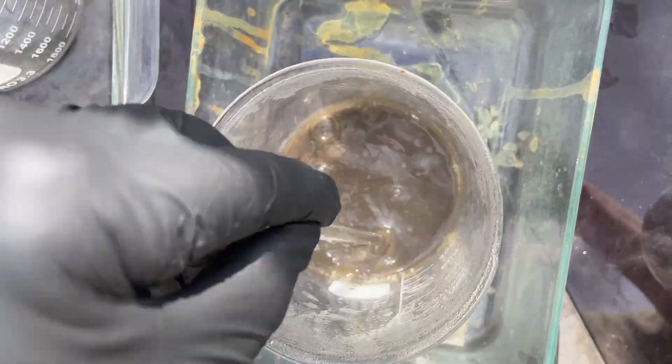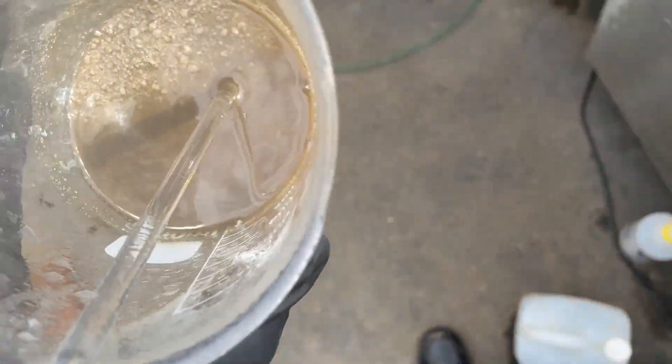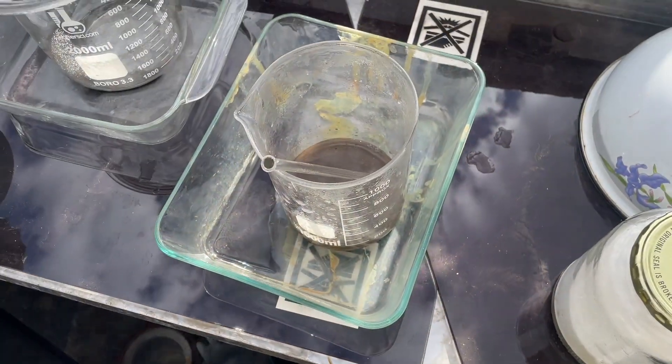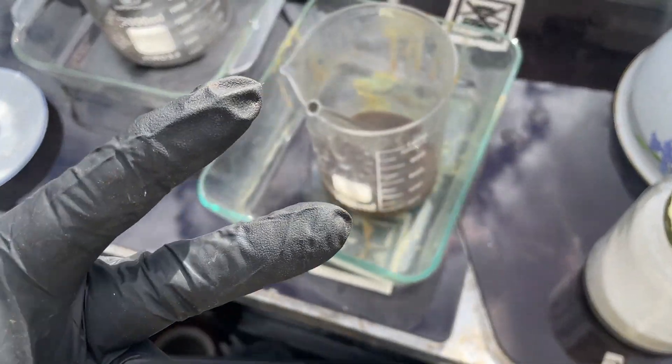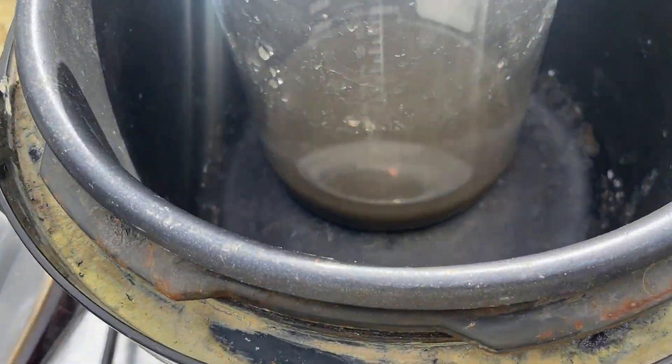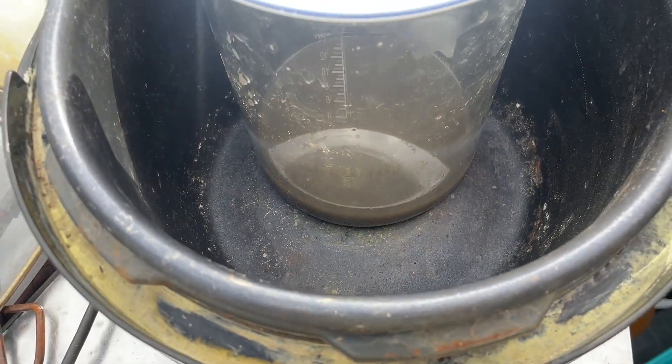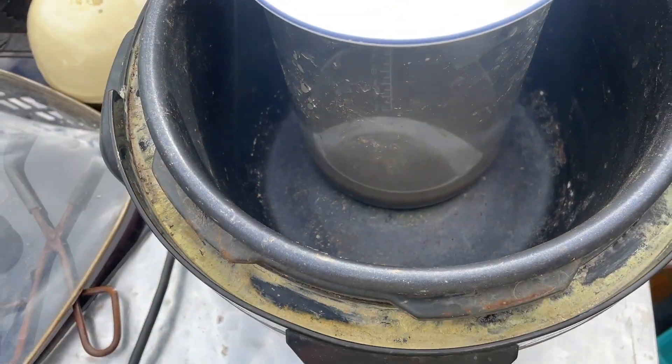We certainly got some silver there now — you can certainly see it. Look at that. I'm going to rinse the heck out of it — same thing again, just like yesterday. We heat that up and pour off that solution, then rinse, rinse, rinse, rinse until we've got her good.